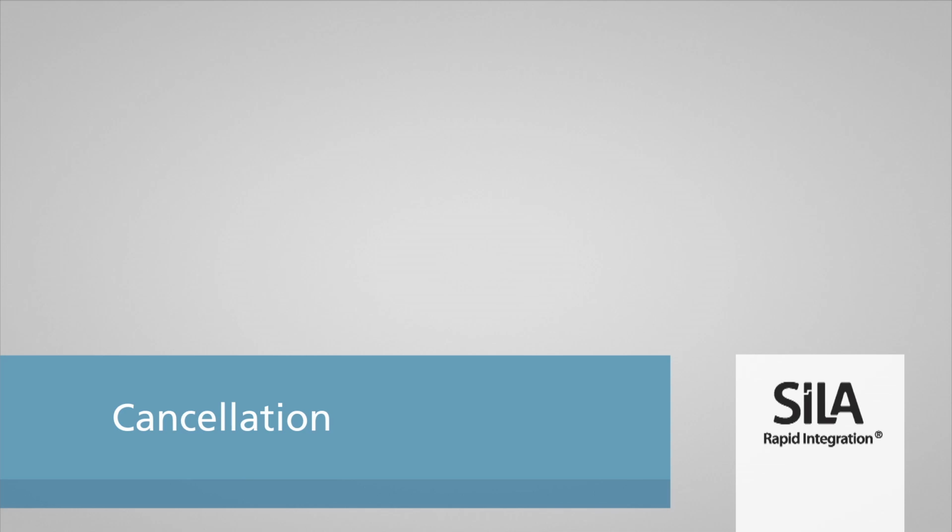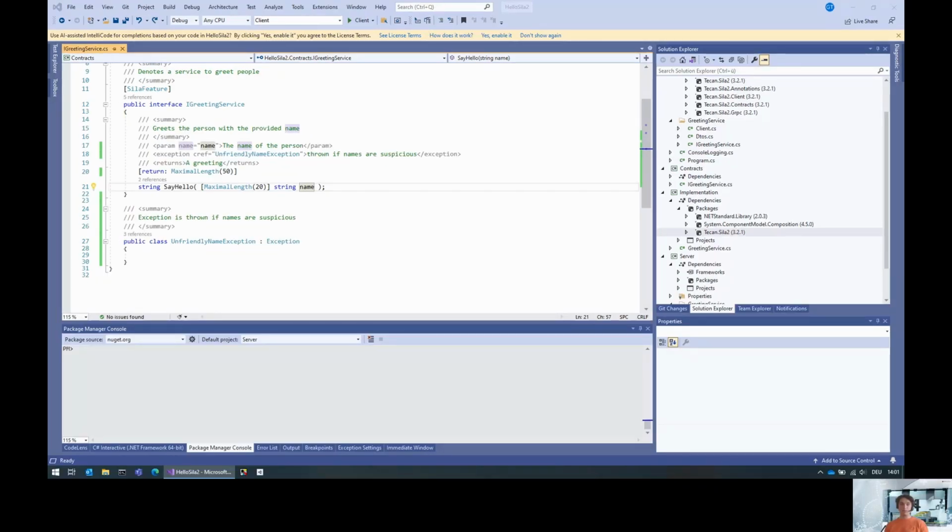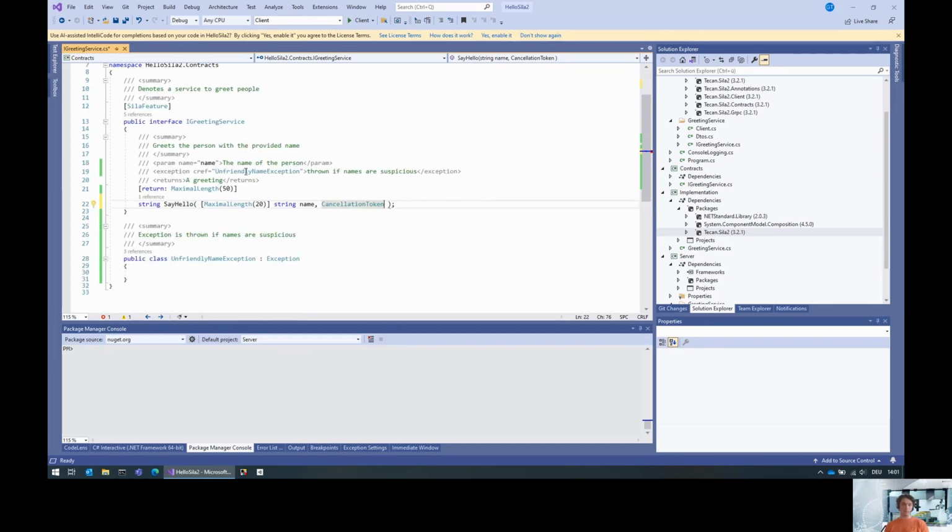Hello, my name is Georg Hinkel, and in this short video, I'm going to show you how to implement cancellation with the Tecan SiLA 2 SDK. So the first thing that you need to do for cancellation is to actually add a cancellation token to the interface that you want to expose. In this video, I'm going to use the greeting service that I've created in previous videos and just add a cancellation token to the interface method.